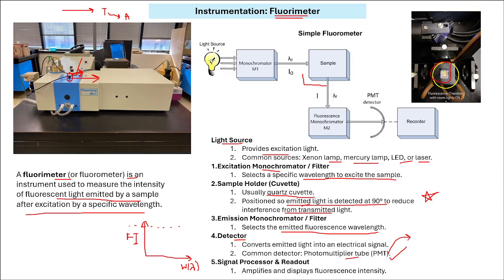And once your PMT is damaged, the machine would come to an end. There is a safe limit, mostly mentioned in the manual as well, so always take care that the fluorescence intensity is not too high, because it would damage your PMT.